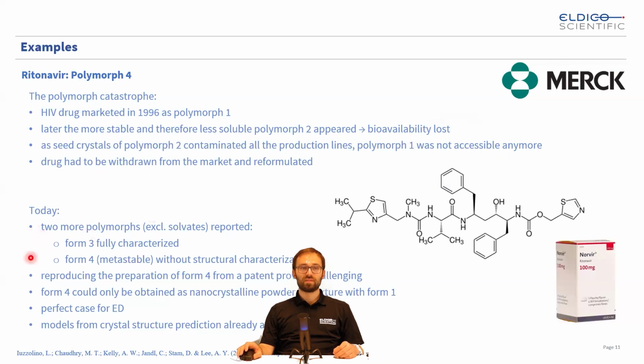I'm excluding the solvates here. One of them, form 3, is fully characterized, and there's another form 4, which is not fully characterized, but it has already been patented. And together with our partners at Merck, we became interested in this form 4. It proved quite challenging to reproduce the preparation of it that was described in a patent. So unfortunately, it could not be obtained in pure form. It was always a mixture with form 1.